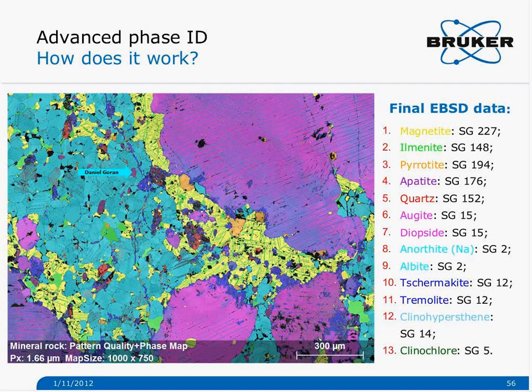And in that particular case, the resolution would be the EBSD resolution, because the indexing is done basically based on the pattern, and the EDS information is only helping us to narrow down the candidate phases from 160,000 phase files. So in that case we will have the resolution of EBSD, which would be, for example, for silicates, maybe 100 nanometers with a good field emission gun.